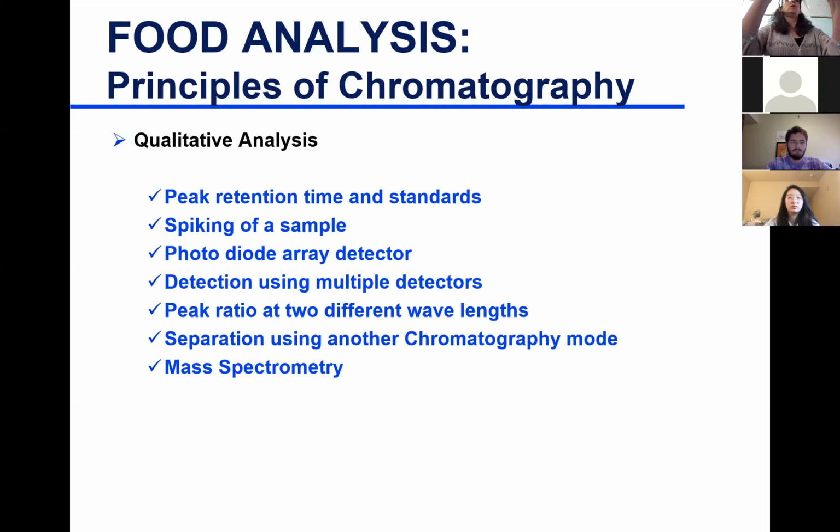But now I have separated one out of the three. If I have a mixture of three, two have the same molecular weight and one has a different molecular weight, I separated one out of the three, and now I have two in one peak. I take that and separate using ion exchange, so I can separate both of them via ion exchange. Because protein is a perfect example where multiple proteins can have the same charge and multiple proteins can have the same size. So to get good separation, I would use multiple modes of separation to isolate all the components in the mixture.